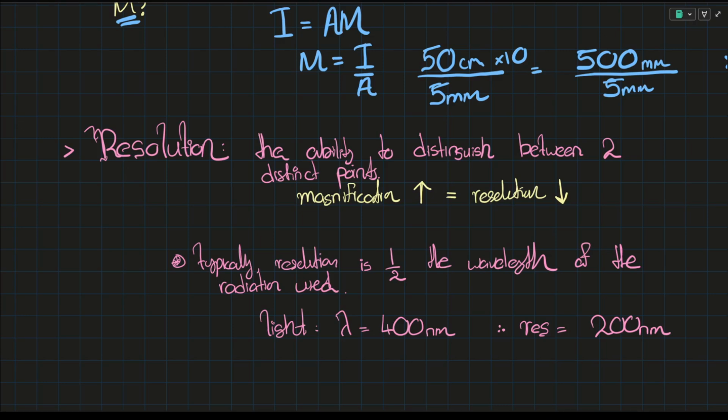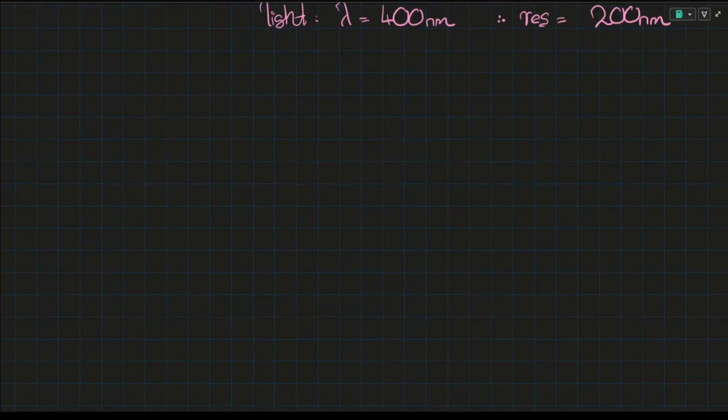Now onwards to a concept that is going to be totally new to you. We're talking about eyepiece graticules and stage micrometers. If that sounds like gibberish, it probably is. Let me write things down. So this is what we'll be doing.